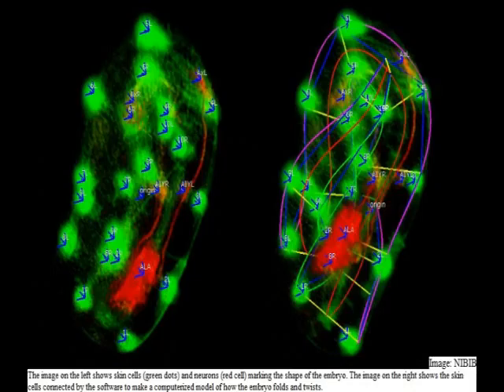This catalog will be the first comprehensive view of how an entire nervous system develops. According to Schaffer, it will be helpful in understanding the fundamental mechanisms by which all nervous systems, including ours, are assembled. They also expect that some of the concepts developed, such as the approach taken to combine neuronal data from multiple embryos, can be applied to additional model organisms besides the worm.